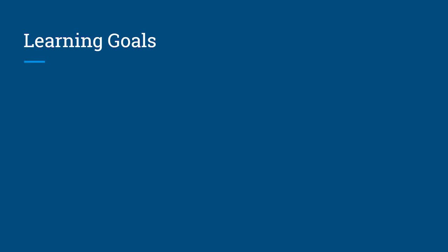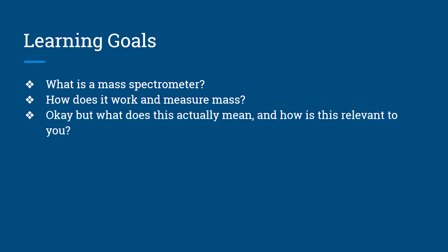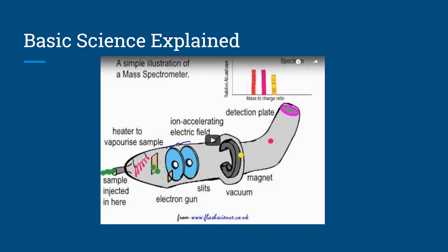Our learning goals. What is a mass spectrometer? How does it work and measure mass? Okay, but what does this actually mean and how is this relevant to you? Here is a simple example of the science behind it all.